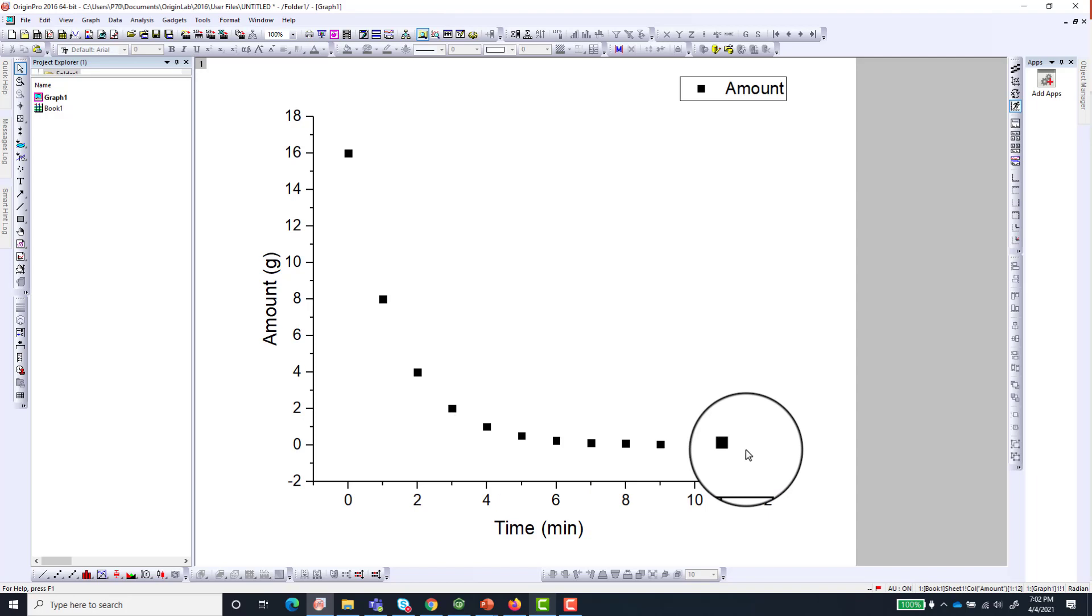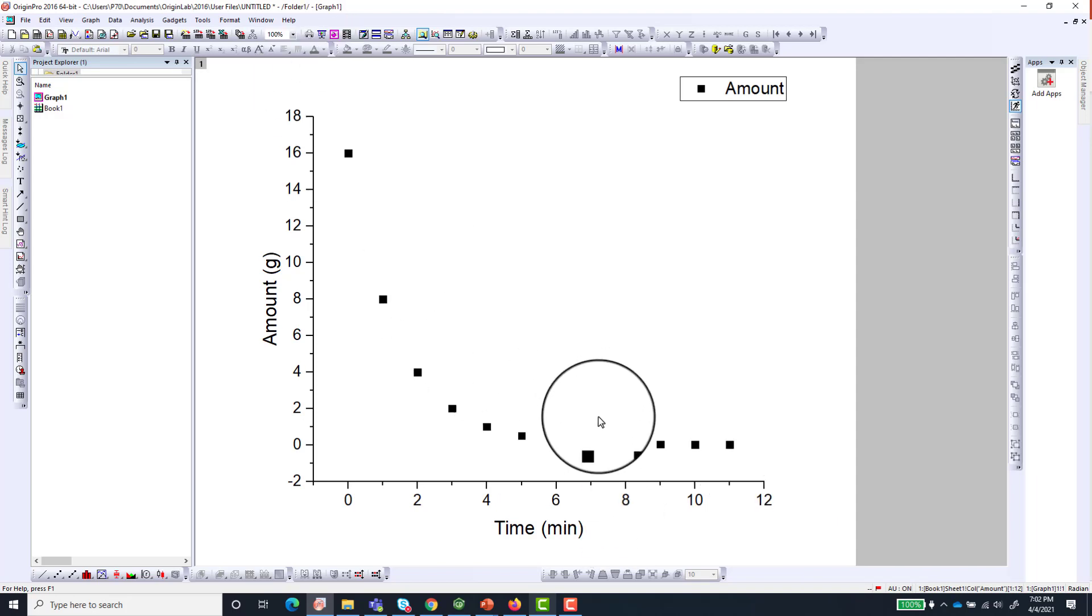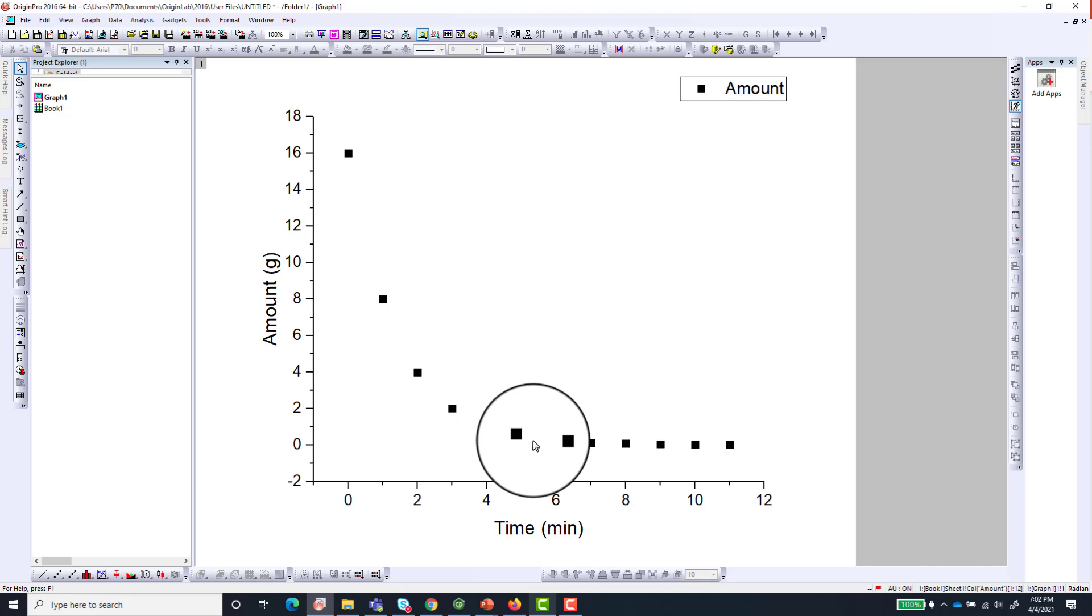So how do we fit this to exponential decay to help obtain parameters like the half-life and some other things like that?